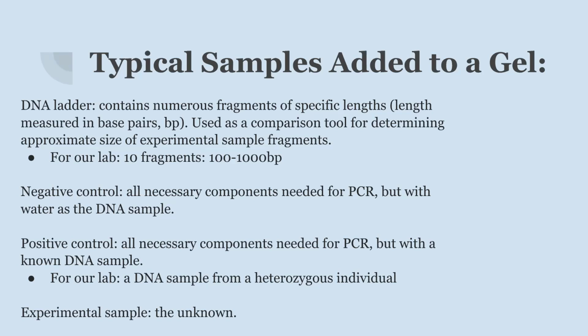At both ends, whether we are on the low end or the high end of what we're trying to observe. In this case, being shorter or longer base pair lengths, okay? So we would see 2 bands with this, and that's the biggest reason why. So we could compare and see what it would look like if someone was PER3-4 homozygous, PER3-5 homozygous, or heterozygous for the traits.